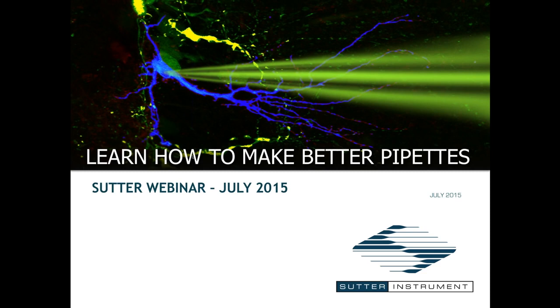All right. How about this one? How often do you perform a ramp test? That is a good question. I will perform a ramp test when I open a new box of glass in case the wall thickness has shifted a little bit with that new run of glass. I will also run a new ramp test when I put in a new filament. And the other times I'll run a ramp test are maybe at the beginning of each week.